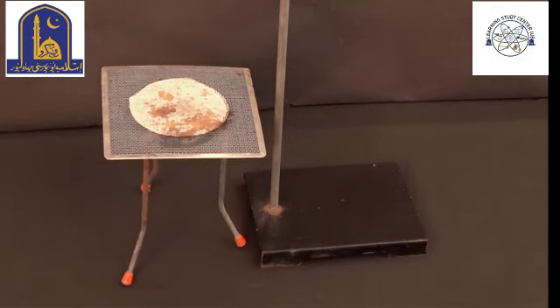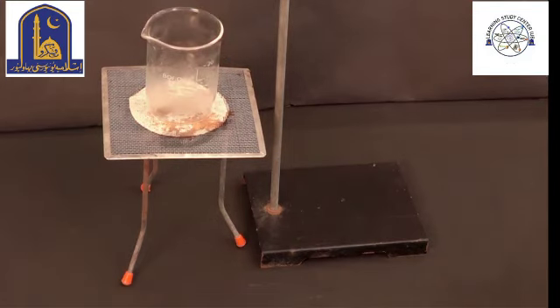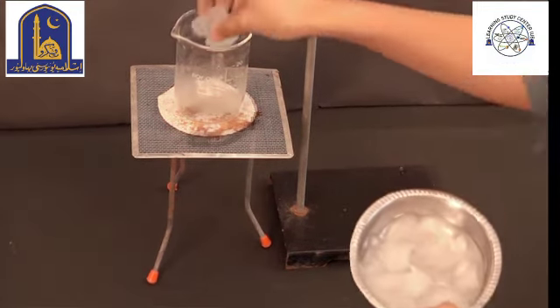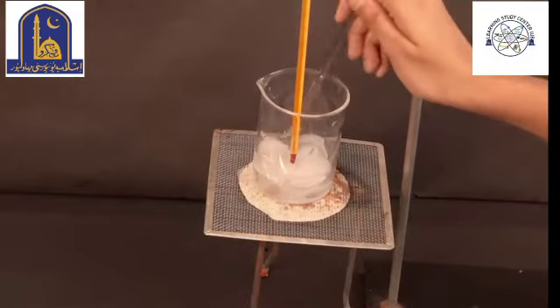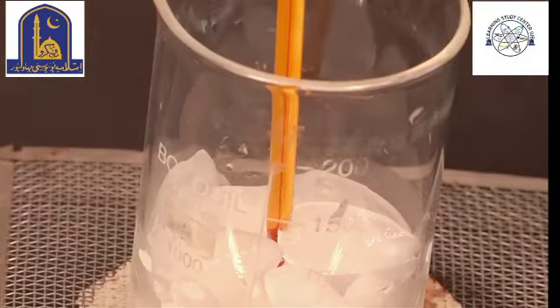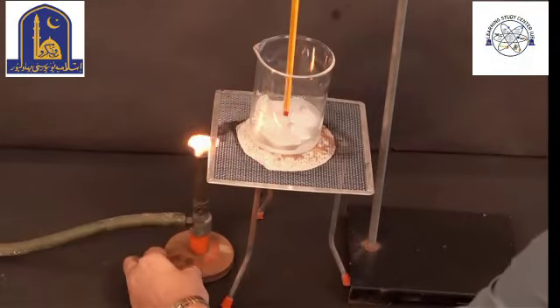Procedure: We have taken a few pieces of ice in a glass beaker. Keep the beaker on the tripod stand. Attach a thermometer to the stand so that the thermometer bulb will completely dip in the ice.